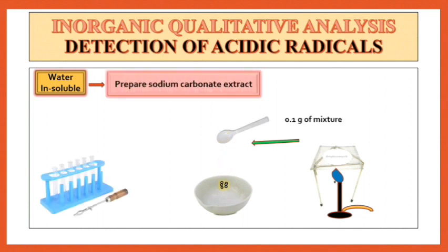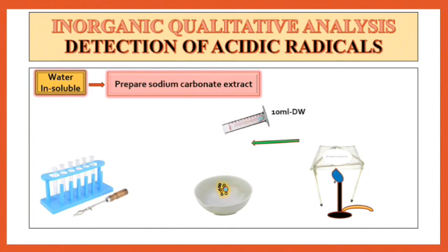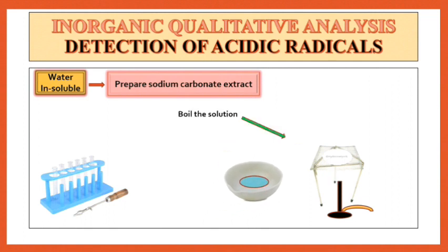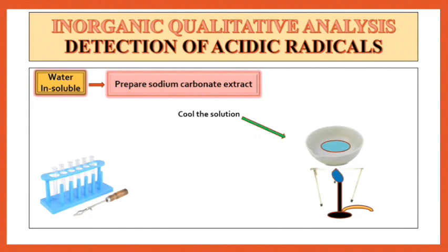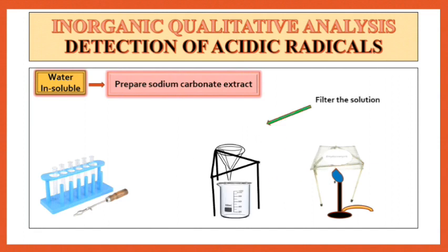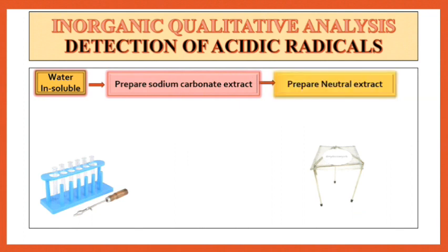For that, take 0.1 gram of mixture and then add 0.2 gram of sodium carbonate. To this, add 10 ml distilled water and boil this solution well. After boiling, cool it well, and then filter the solution through ordinary filter paper. This is sodium carbonate extract.